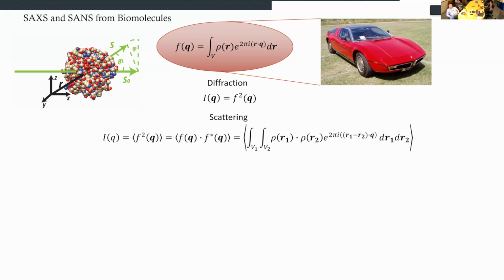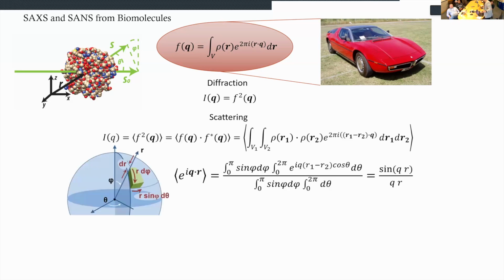You are averaging over all of the electron density and all of its rotations. So this triangular bracket hides an awful part of where we lose information. We're averaging around, and instead of having this wonderful vectorial part where you can get all the distances between all the electrons and what direction they are, you end up non-vectorial, and you end up scalar.